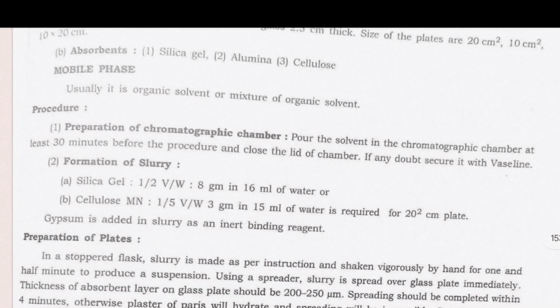Procedure. Preparation of the chromatography chamber. Pour the solvent in the chromatography chamber at least 30 minutes before the procedure and close the lid of the chamber. If in any doubt, secure it with Vaseline.